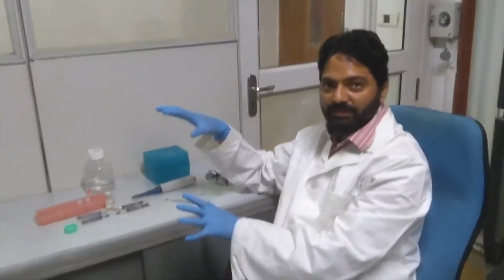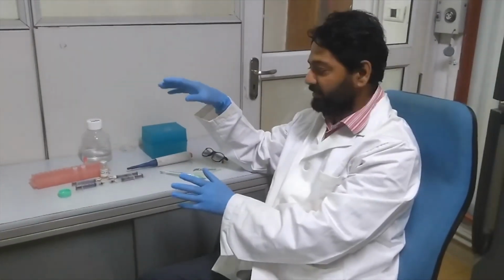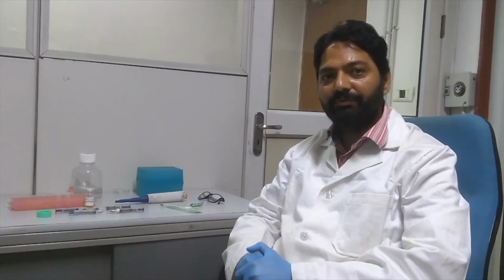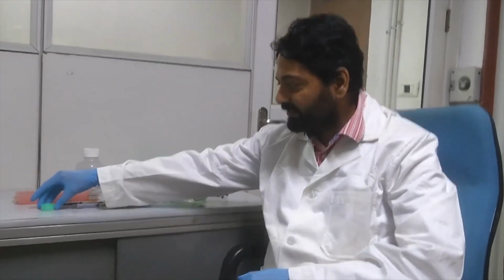So this was the process by which we prepare the emulsion for injection. This is the first step. Now let us understand why we prepare the emulsion. We have checked that the emulsion is formed.